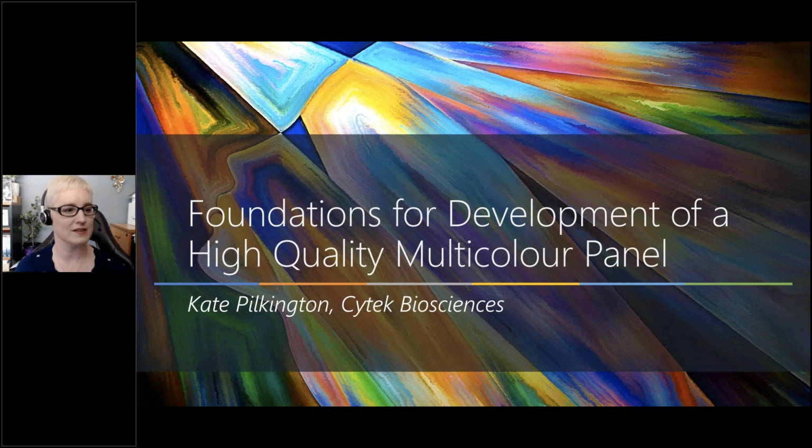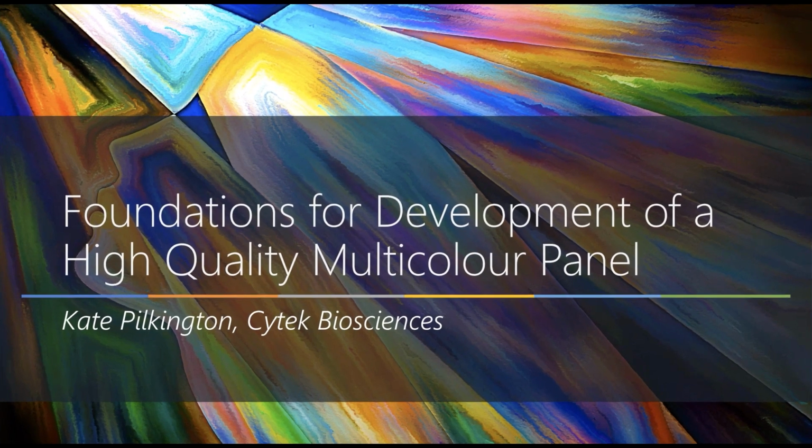And before Lara presents to us later about her panel design and her research and how she's applied those together, I'm going to give you a very high-level overview of panel design concepts. So before we speak about those panel design concepts, and so that you don't have my little bobblehead going around, I'm going to kill my camera for the speech.